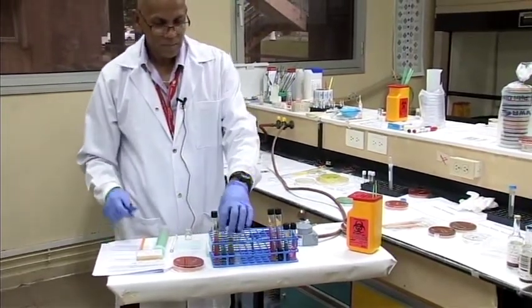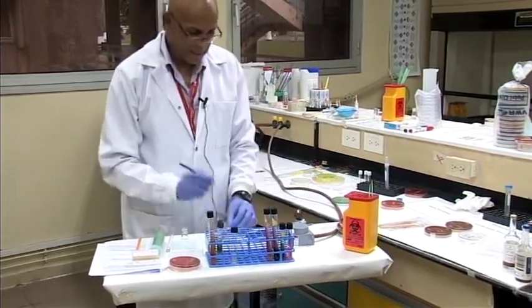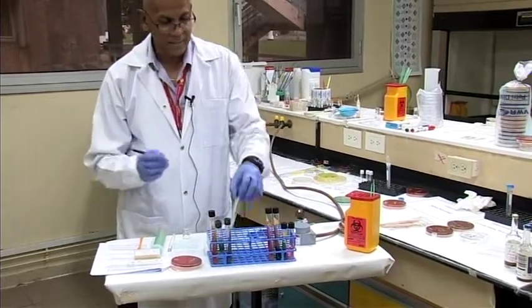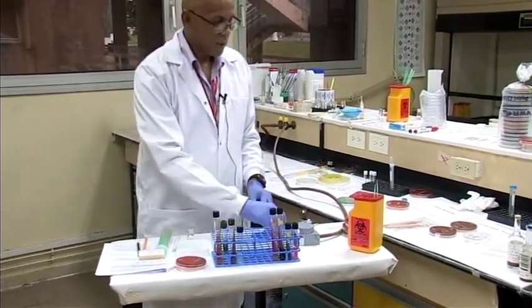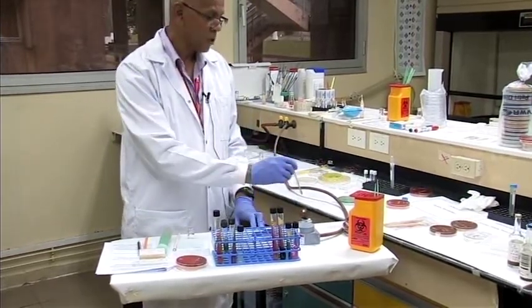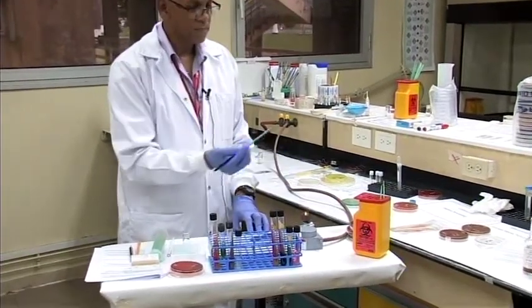All right, so we'll label up our tubes quickly. The best labeling tool you can use is a Sharpie marker. Sometimes wax pencils will erase easily. Sharpies work fine. Now, because some time has elapsed, and to avoid contamination, you want to make sure your straight wire is sterile again. So I'll go back and flame again.